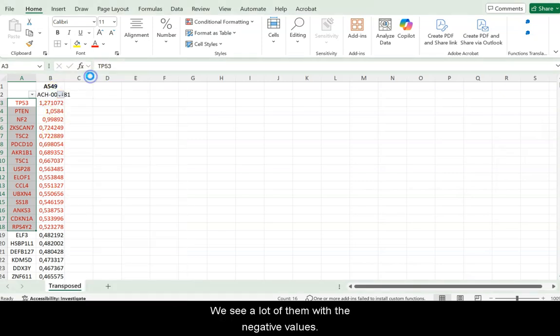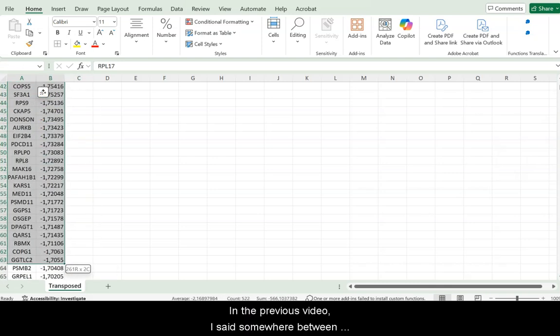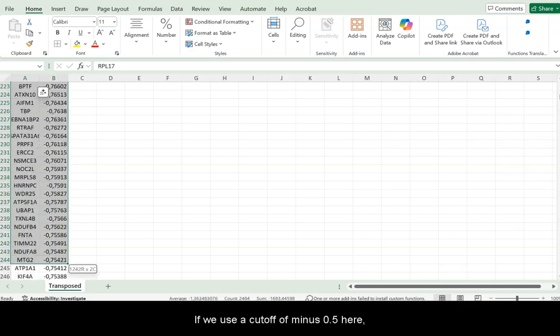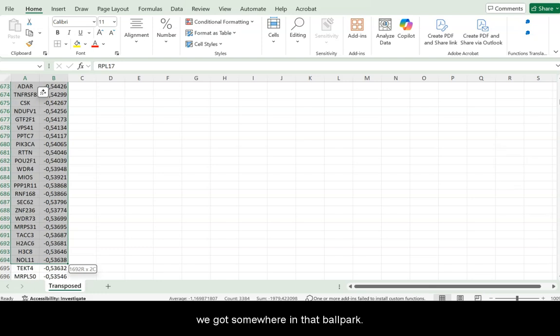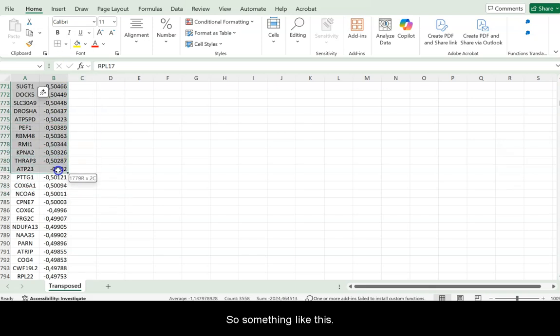But we see a lot of them with negative values here, right? In the previous video, I said somewhere between 1,000 and 2,000. And I think if we use a cutoff of minus 0.5 here, we got somewhere in that ballpark.